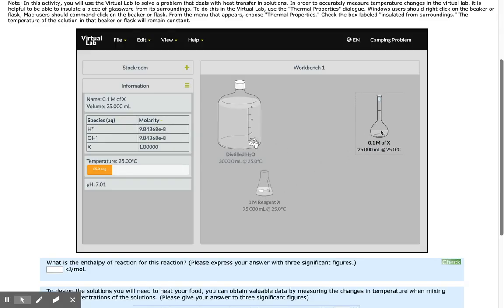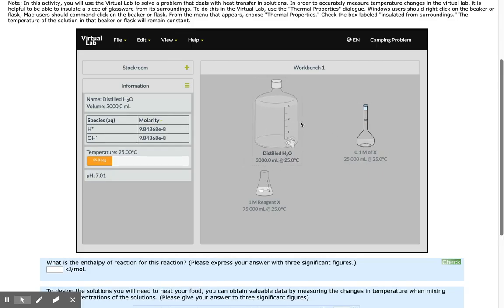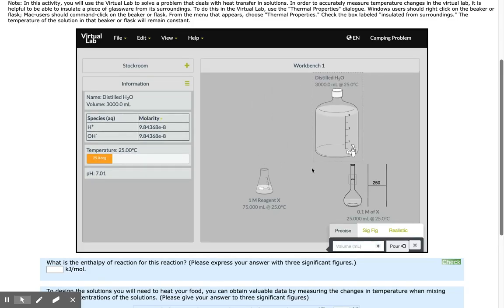Now I need to bring the total volume up to the graduation mark, which is 250 milliliters. I'm going to add distilled water.